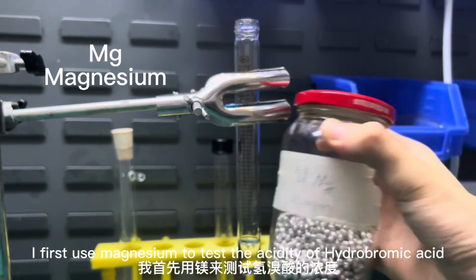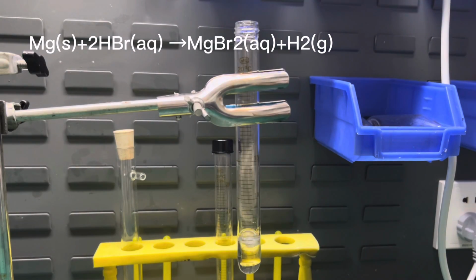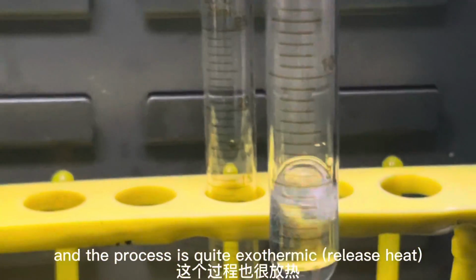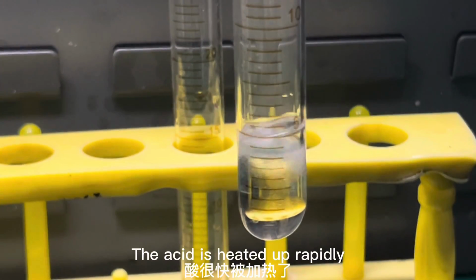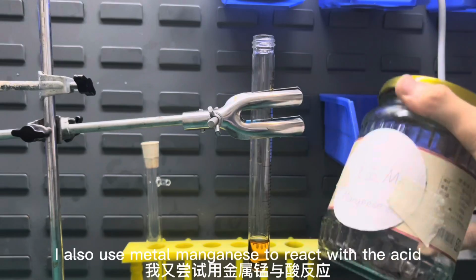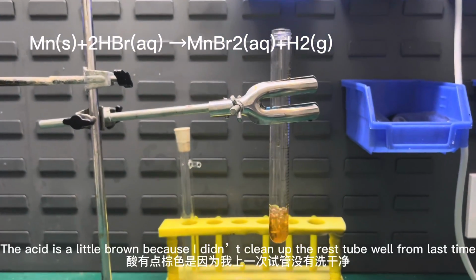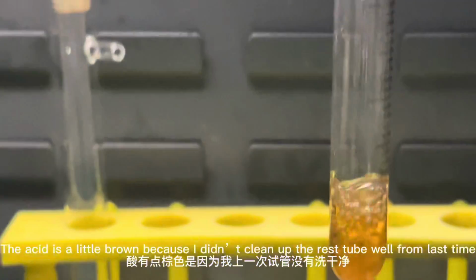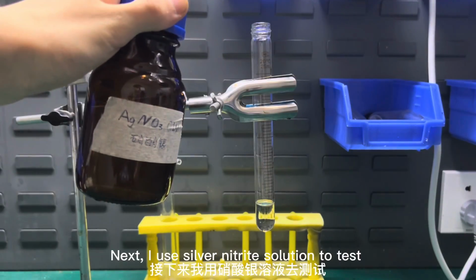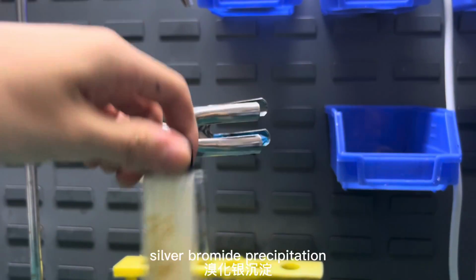I first used magnesium to test the acidity of hydrobromic acid. Magnesium reacts very fast with the acid, and the process is quite exothermic. The acid is heated up rapidly. I also use metal manganese to react with the acid. The acid is a little brown because I didn't clean up the test tube well from last time, but it doesn't affect the result.